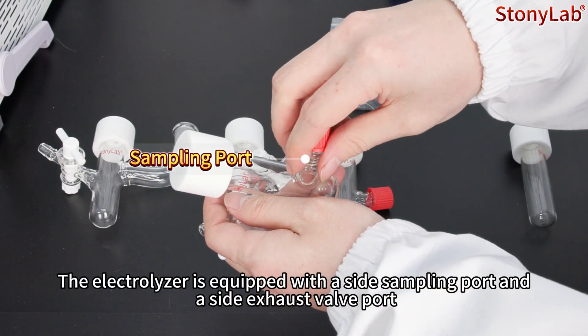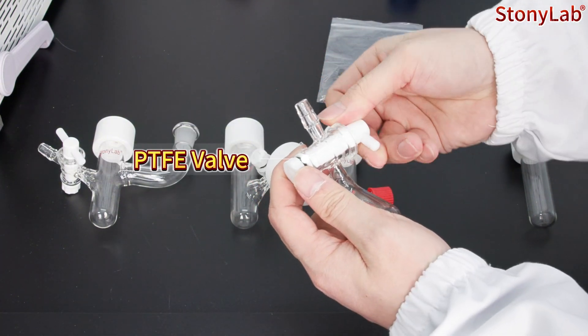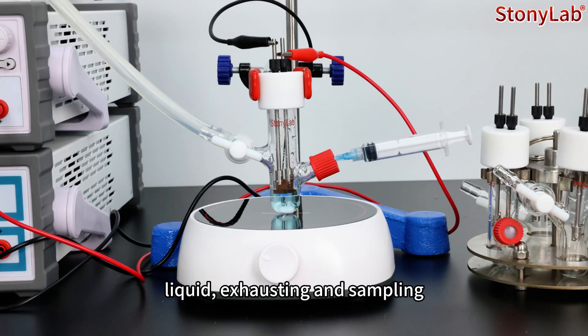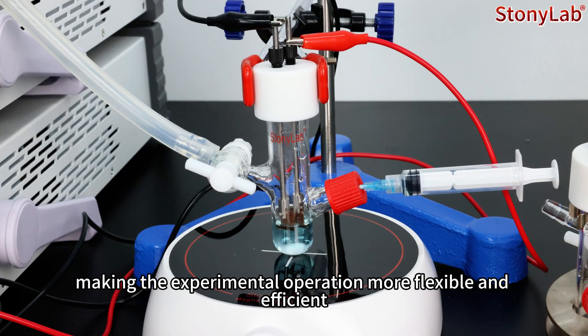The electrolyzer is equipped with a side sampling port and a side exhaust valve port, which is convenient for introducing gas, liquid, exhausting and sampling, making the experiment operations more flexible and efficient.